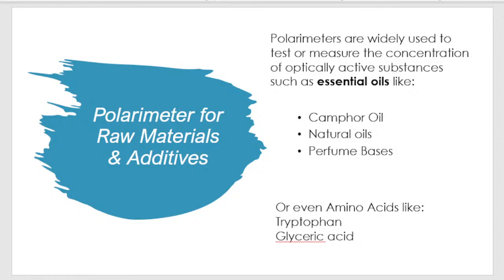We covered that in a different webinar where we spoke about the polarimeters and the chiral molecules. So we're not going to cover that here, but I did want to mention that not all liquids, not all oils that you use in the cosmetic industry are optically active. So polarimeters are used only when you're using optically active substances.